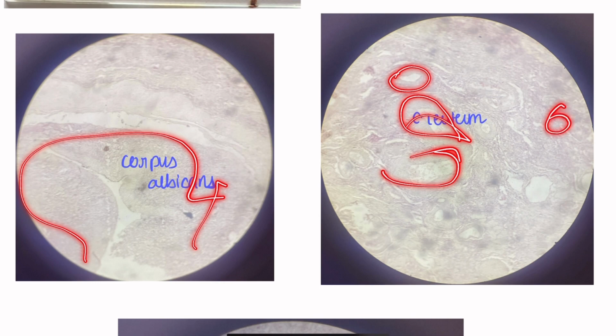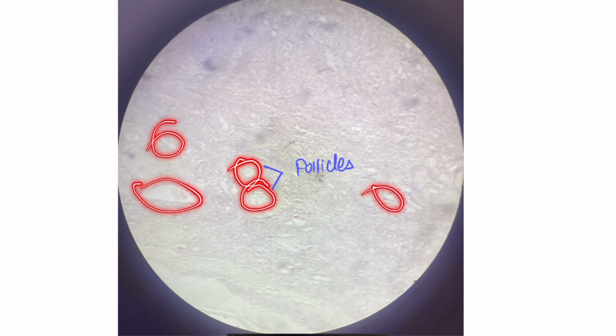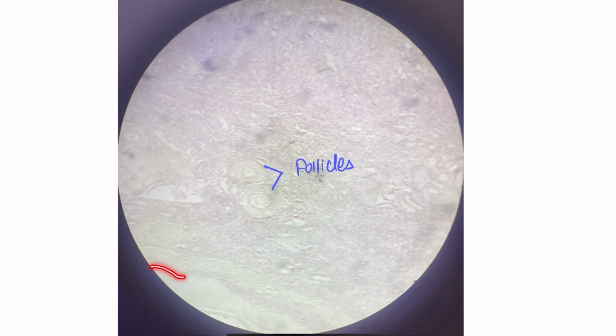You can appreciate various different follicles in the slide of ovary. Here also you can appreciate different follicles and the blood vessels, capillary, the lining germinal epithelium, and below it the tunica albuginea, which is the connective tissue.